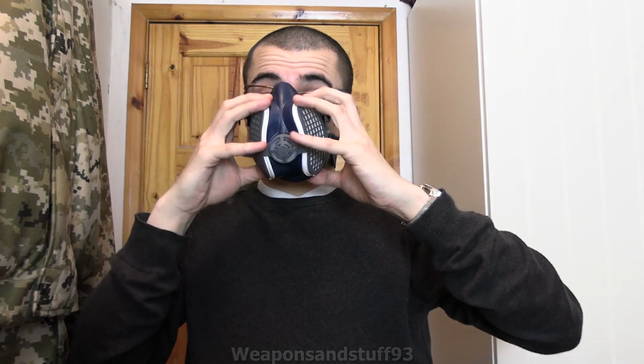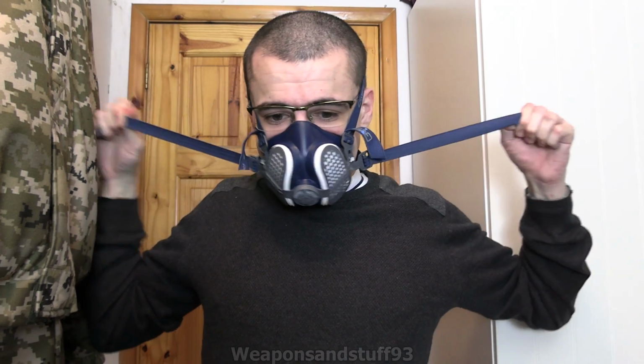So there's that, the head strap, a bit more slimline than a lot of the head straps on different masks, but we'll see how it goes. So let's put this on like that, pull my glasses up out the way. So I'd assume you'd get the head strap about here on your head, and then tighten this bit here, so there we go. So does this make a good face seal? I assume you tighten the rear strap as well once you've got it on. Yeah, there we go. So let's get that about there. That's the rear strap tightened.